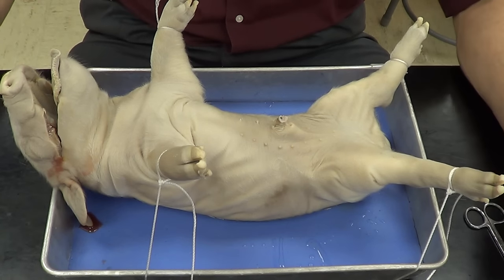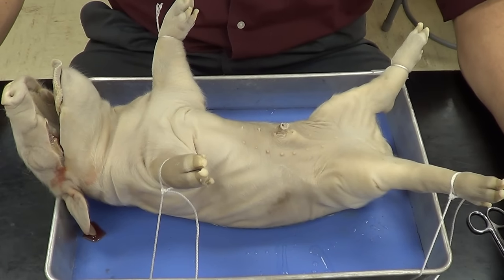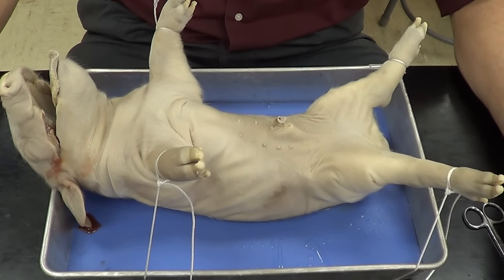In this video, we're going to open up the abdominal cavity and pelvic cavity of the fetal pig.